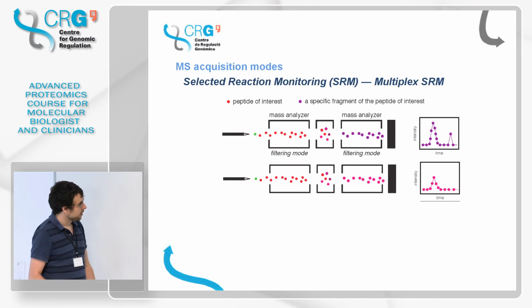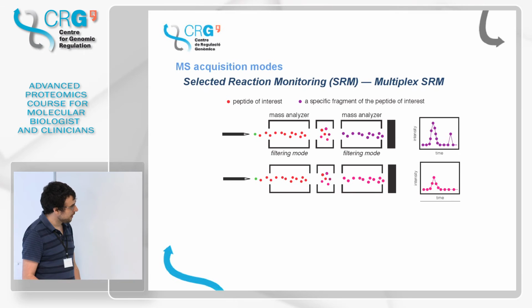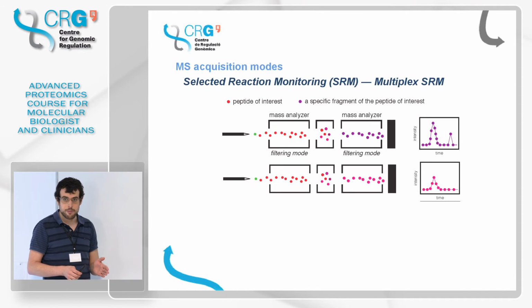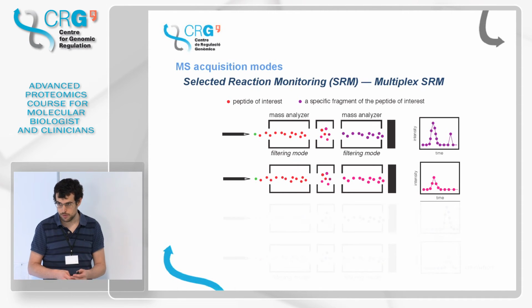And what this allows me is to actually see that if this is my peptide of interest, both fragments should coelute, because the peptide is eluting as one signal at one given moment. And therefore, I can say, well, this was the signal because it coelutes with a second fragment of my peptide, not this one. Okay, and if I do this for several fragments sequentially, I can get information also about the sequence of my peptide without having to do the MS2, right?